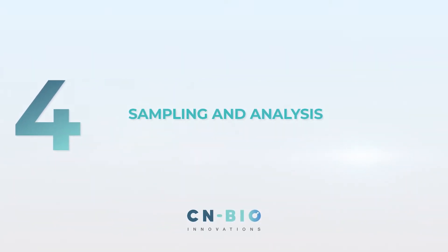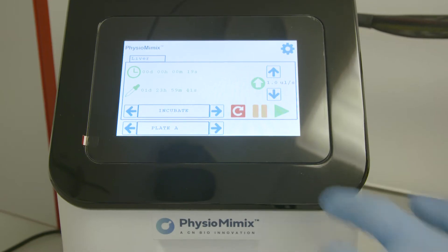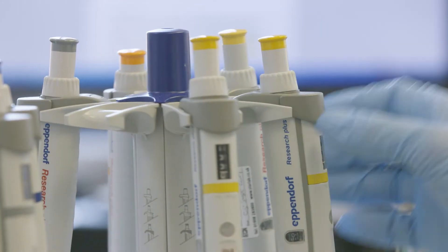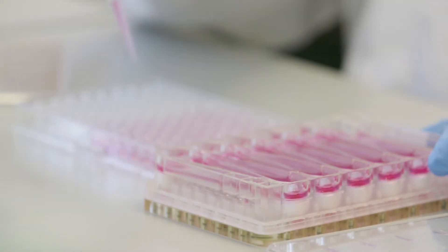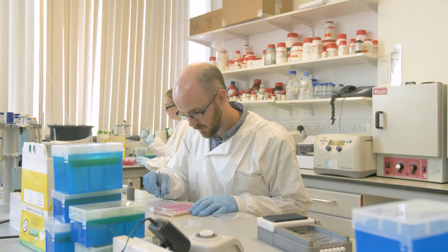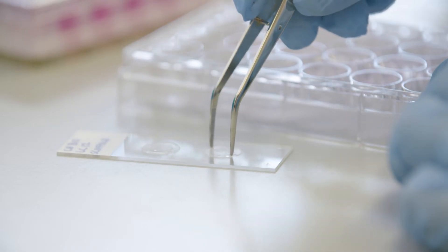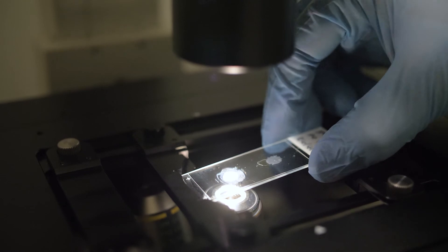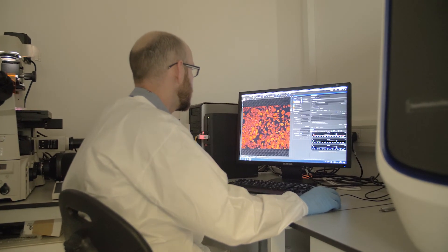Step 4: Sampling and Analysis. Media and cellular endpoint analysis can be easily performed from PMXOOC samples. During an experiment, pause the program and remove the MPS driver from its docking station. Media can be sampled into a 96-well analysis plate, for example, to test for the presence of soluble biomarkers. To analyse the cells from the experiment, remove the scaffold from the MPS plate for imaging or for lysis of the tissue. Scaffolds from MPS plates can be imaged by many approaches, including confocal, EM and histological staining. Performing omics analysis on PMXOOC samples will enable detailed understanding of human cells' response to a particular drug or chemical.